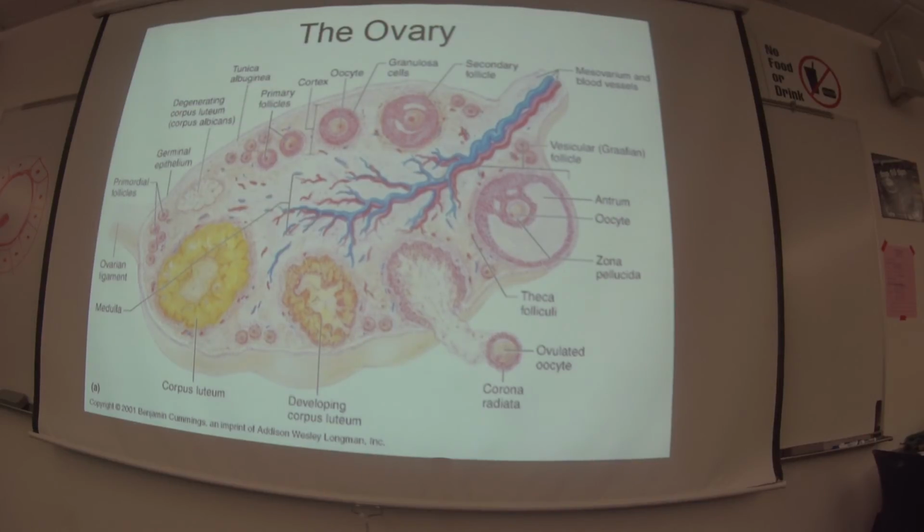Because it protects the cell, number one, it gives it a structure. Because the very, very large oocyte, it's hard to be a big cell. It's hard to keep your shape ideal, and this helps with that. It is actually kind of this color when you look under a microscope. Some of them it's a little bit more blue, but for the most part it's this dark pink ring. And it's all protein, it's not a cell, so there are no nuclei. This is just a thick protein capsule around an oocyte.